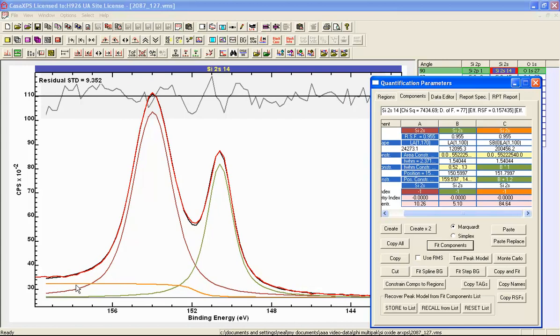So the background interacts with the photoemission line shape to determine the areas of peaks and other properties of this peak model. This is rather important when we want to work out the area between an oxide and an elemental peak. For example, if we wanted to work out the film thickness of the oxide based on the Hill equation, this ratio is the important factor in the calculation.